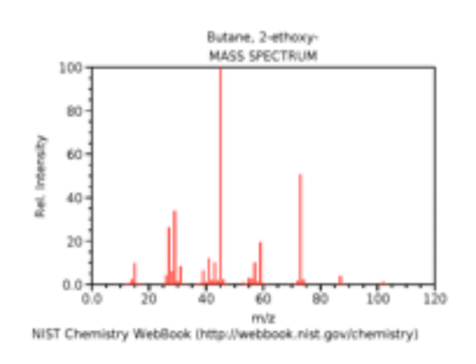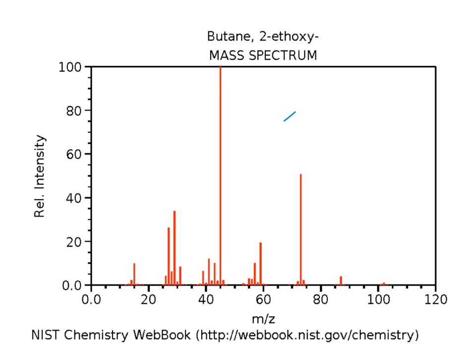functional groups. Okay, so this is 2-ethoxybutane, not benzene. So like this.